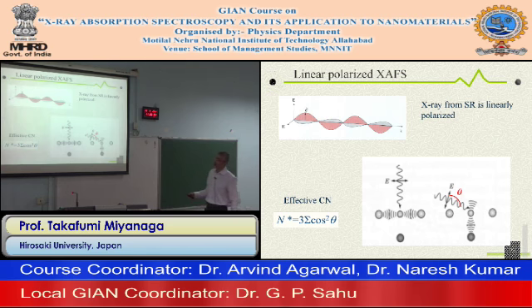In the case of surface EXAFS, the electric vector is parallel to the surface direction, so X-rays give only the information parallel to the surface. Or, in this case, X-rays are incident at glancing angles, so the electric vector is perpendicular to the surface, and the EXAFS information includes only the direction perpendicular to the surface.